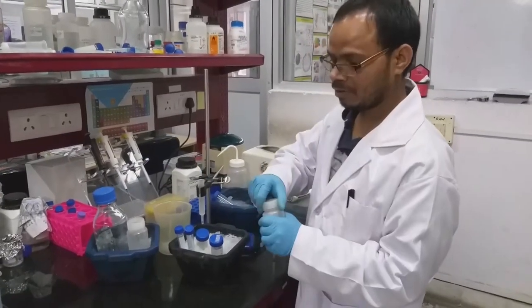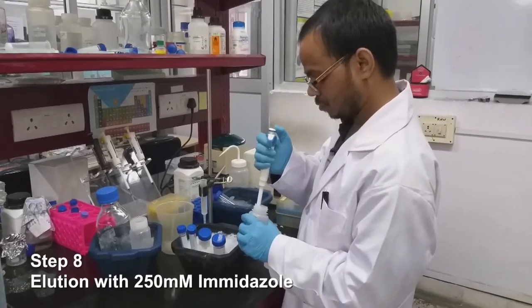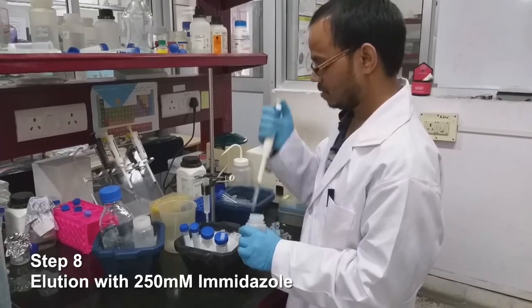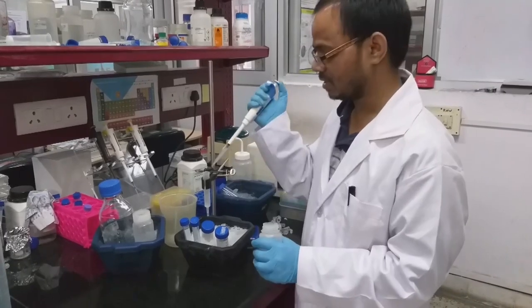Final step, we are going to elute with the 250 millimolar imidazole containing buffer. So what we are going to do is incubate the beads with this buffer for some time and collect the fractions.